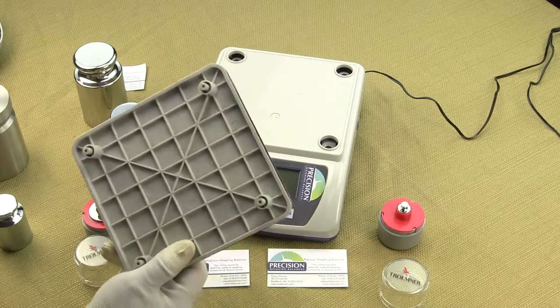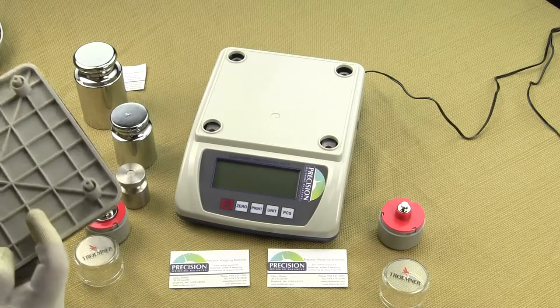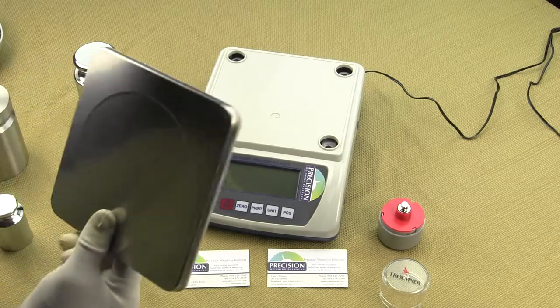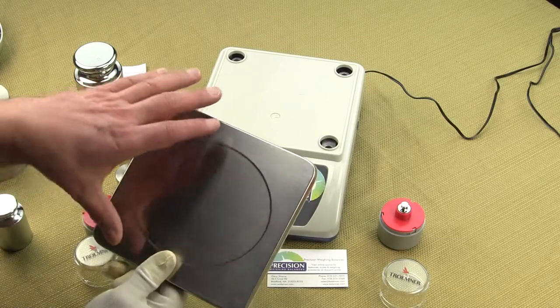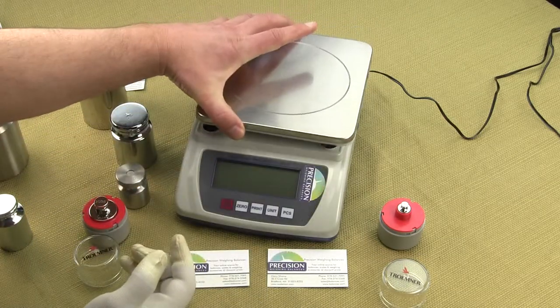Other manufacturers don't design their scales like this because they basically want the scale to break so you need to buy another one. You'll learn the hard way, since load cell damage is not covered under warranty.